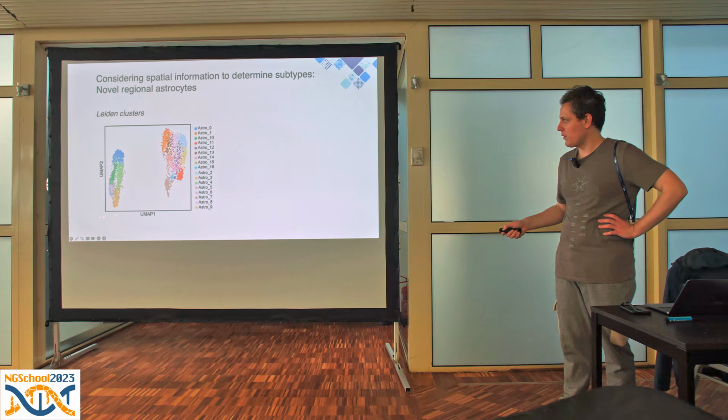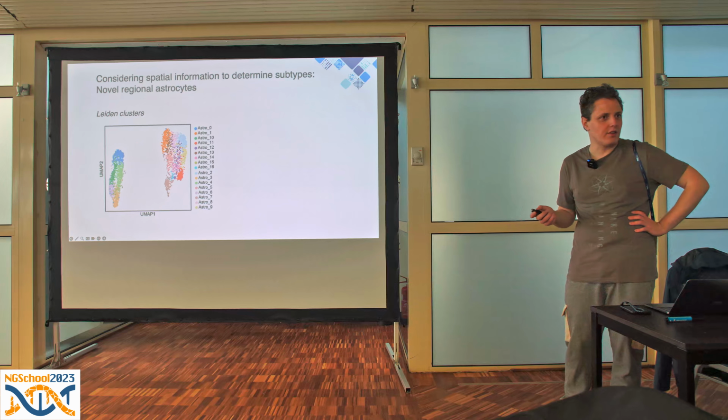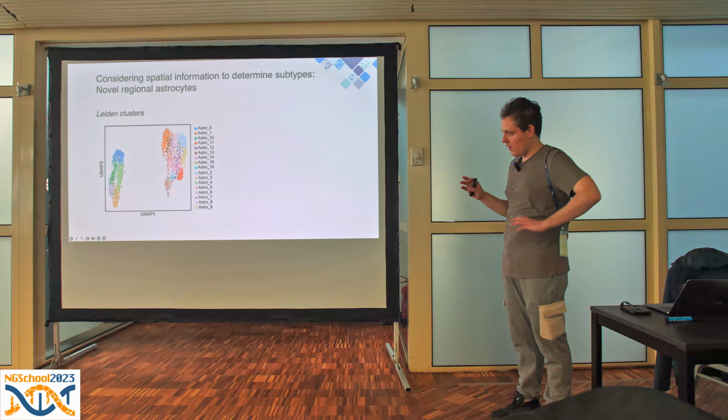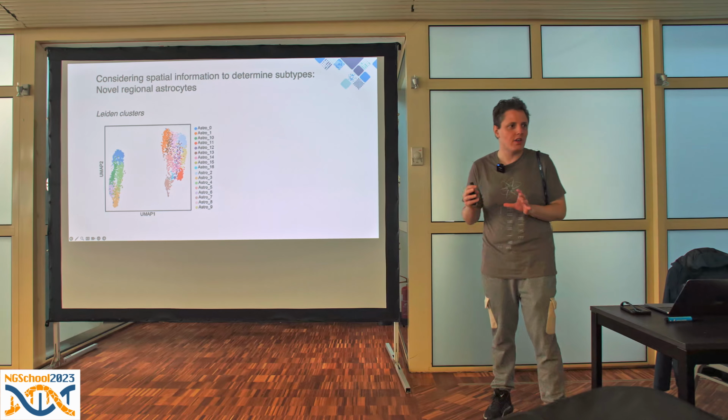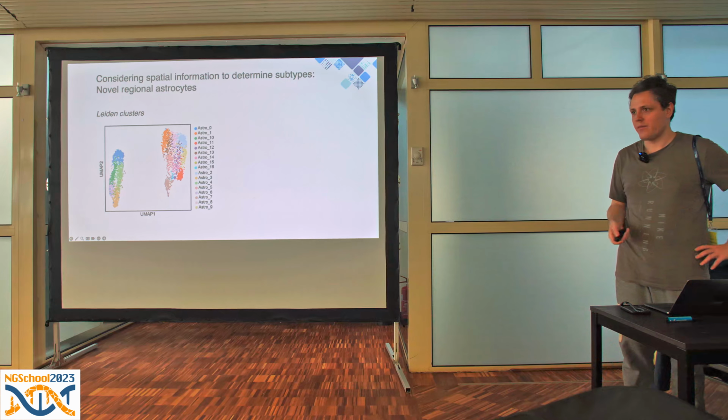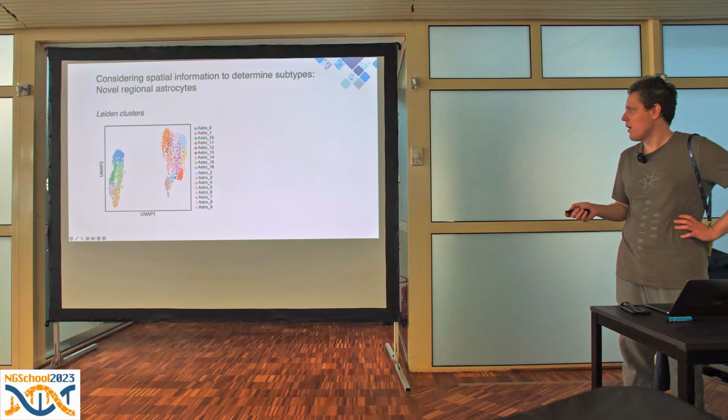You see the main difference between telencephalic and diencephalic astrocytes. Telencephalic are cortex and subcortical areas, diencephalic are thalamus and hypothalamus. We aimed for a high number of transcriptionally distinct clusters. And if you subcluster cell types like astrocytes and you get a lot of clusters, you don't really know if they are real. You can examine the marker genes, as you learned earlier in this workshop, but they wouldn't necessarily tell you what they mean.